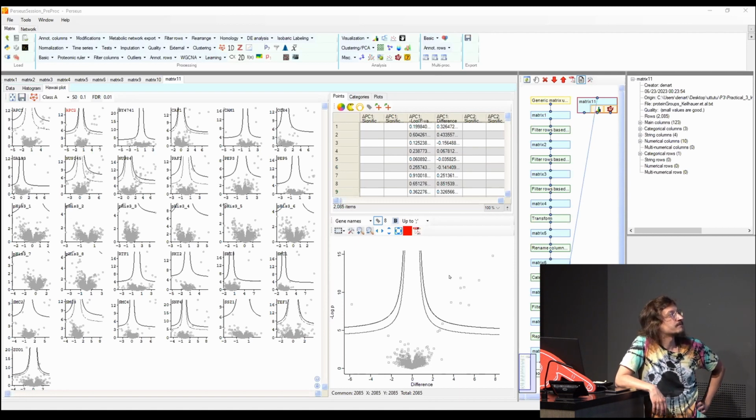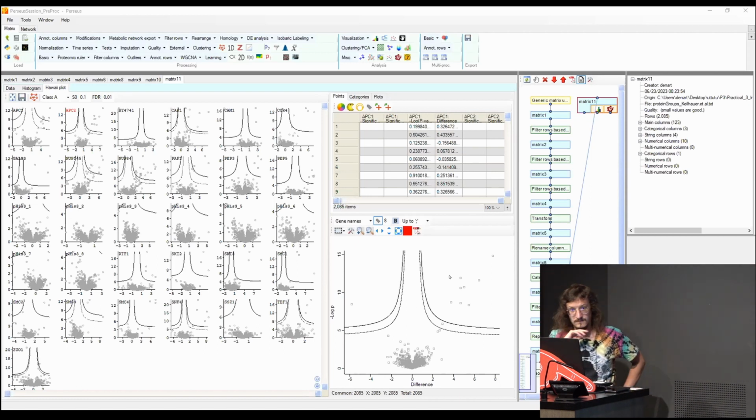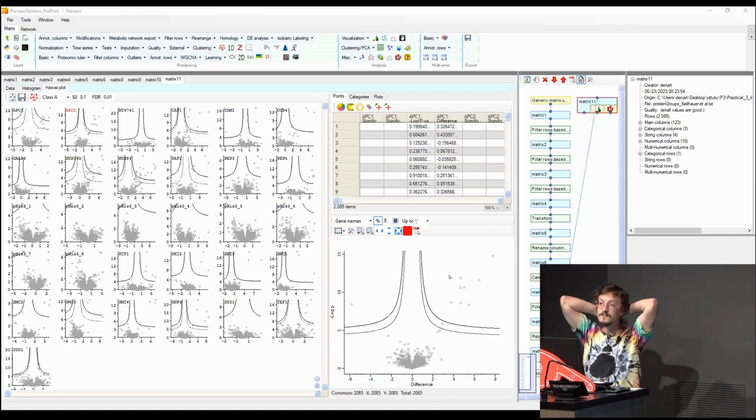I think it doesn't look quite as good, because the way we calculate the q-value is a little bit discrete. Many of the very significant ones are then zero, really zero. And if you log them, they would be undefined, or you would have to use some minimal threshold for those. So first of all, as Carlo said, they become a little bit squeezed, but also they're not so pretty because of this discretization of the q-value.